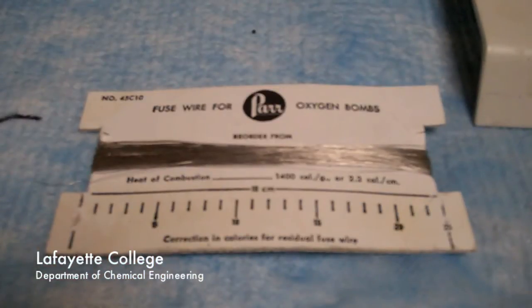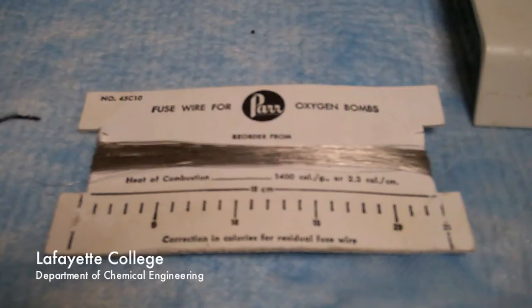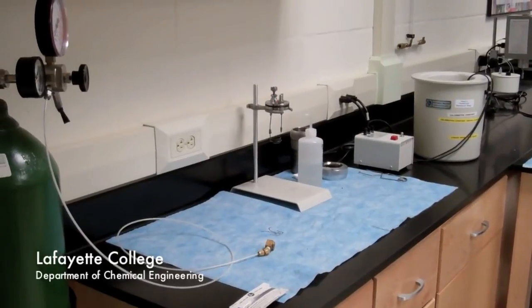This wire can be measured using a special scale and factored into the calculation for heat of combustion to account for the heat released by burning the wire. The experiment is complete and the bomb is ready for another run.